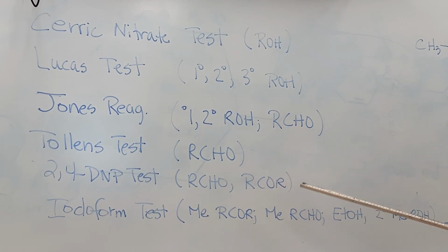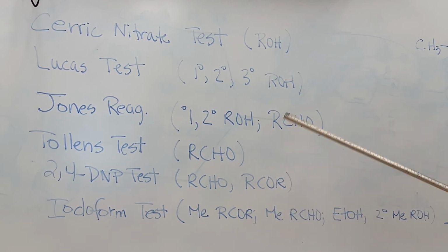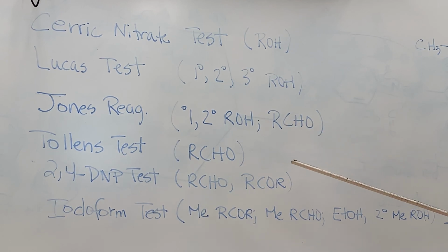Once you have the functional group, I'll have some boiling point information, or melting point if it's solid. I'll have density information provided. You may have to calculate that density, but you can do that. Once you figure out what functional group you have, the chemical formula would also be given. And what I'd like students to do is, once they have that chemical formula, based on the information they've obtained in the lab, write all the different isomers of that compound with that chemical formula, and then look up physical data such as densities and boiling points, things of that type.